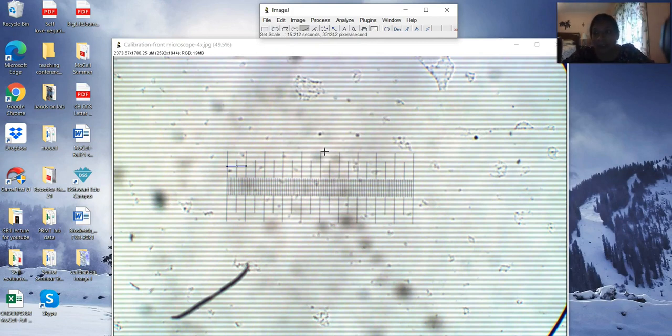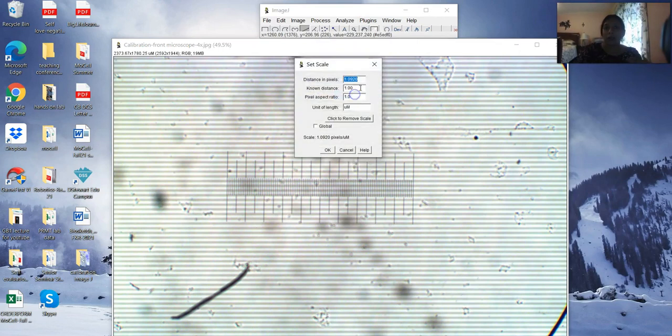If I were to measure a cell or an object using the scanning objective lens, that's the calibration that I would want to use. Now you could make a chart for yourself, and you could save these calibrations so that the next time around you don't need to make these measurements again. You could just open up your image, go to set scale, set the scale to whatever calibration corresponds to the image magnification that you're using, and just start measuring. In this case, that's not important, so we're not going to worry about that right away because we're not actually measuring anything right now.